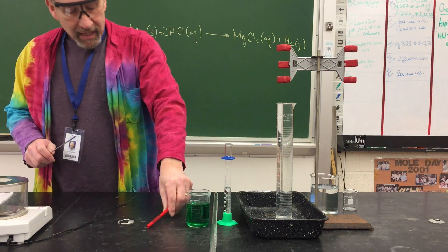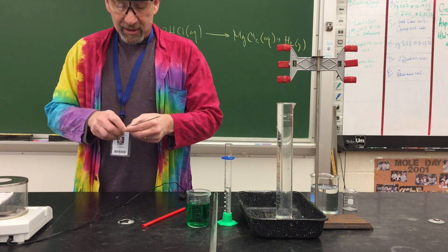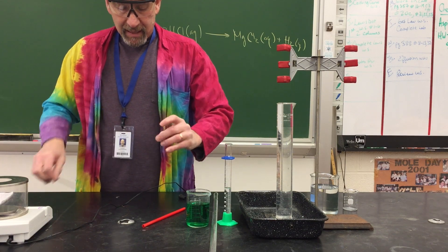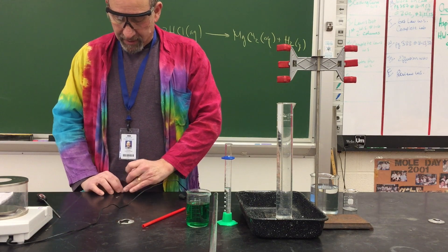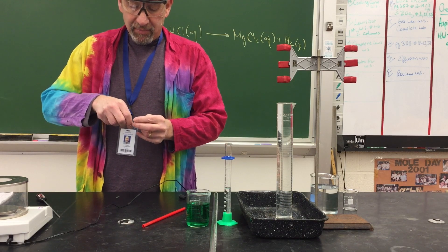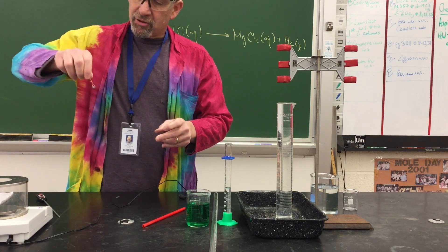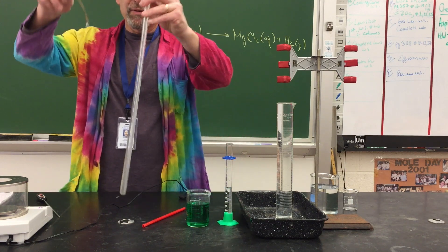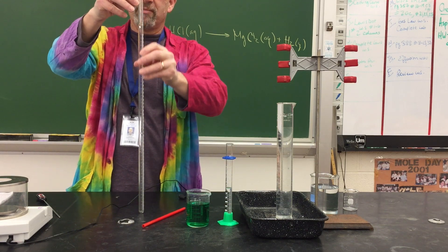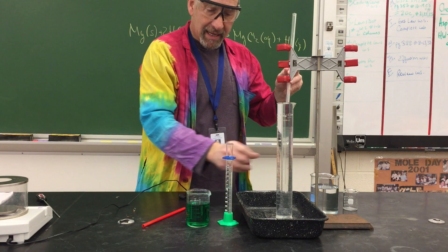I'm now going to take the magnesium and wrap it around the thermometer to give me a loose coil. I don't want it too tight, otherwise it might not react well, but it's got to be small enough to fit into the Udometer. I'll then take a strip of copper wire — copper won't react with hydrochloric acid — to hold the magnesium in place, give it a twist, shake to make sure it doesn't come off, and temporarily insert it into the end of the Udometer with a little hook so it will hold in place when put into solution.